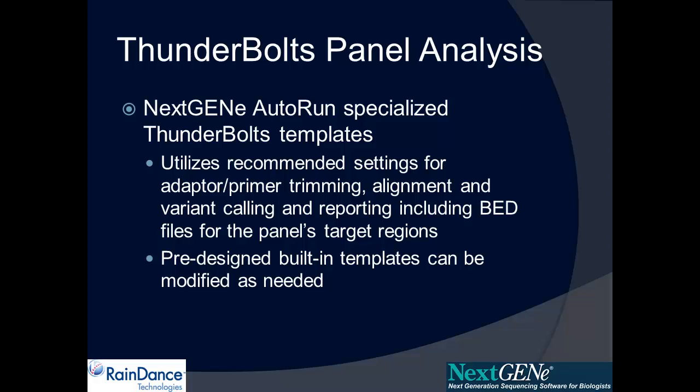These templates include recommended settings that are designed specifically for ThunderBolts data, including settings for primer and adapter trimming, alignment and variant calling, and reporting based on bed files for the panel's target regions. These pre-designed templates can also be modified as needed to create custom templates.